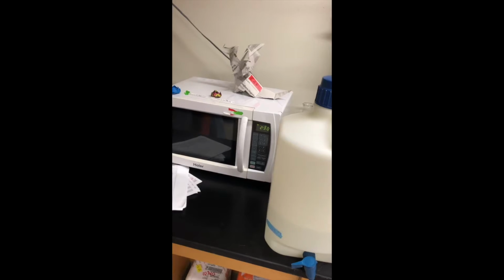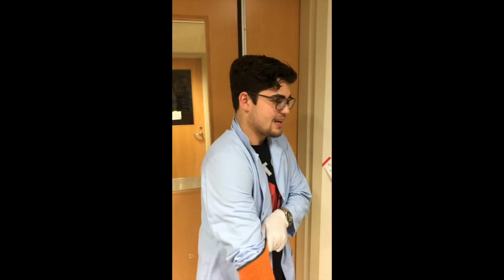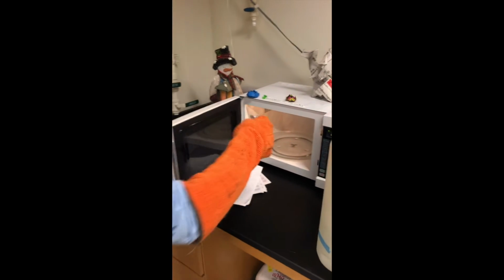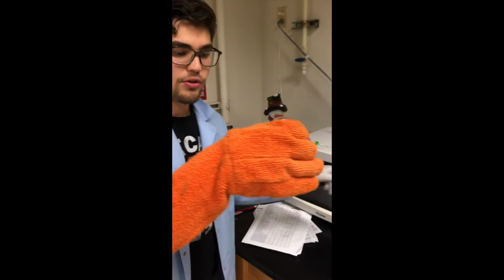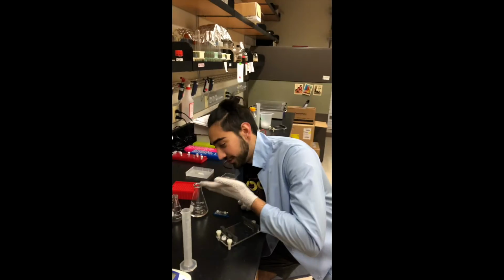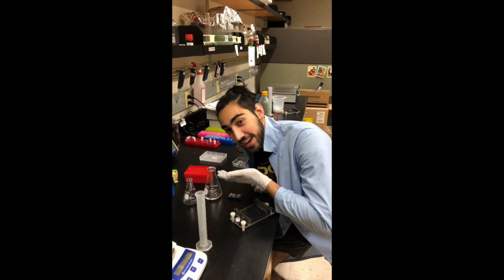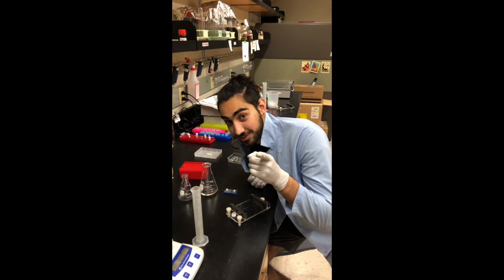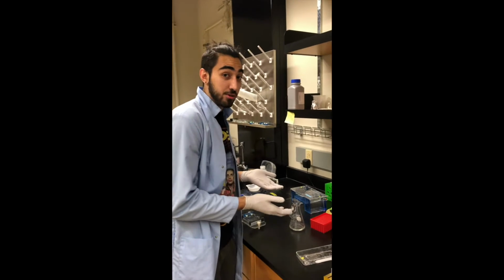Moments later. Okay, after you stop it, you're going to take it out and make sure that you have your heat glove on because this will be hot. I'm going to take it out, mix it around, make sure that all the agarose is dissolved in the TAE. This flask is very hot, so now we have to wait 2 minutes for it to cool to move on to the next step of the process. 2 very boring minutes later. 2 minutes has passed and we're ready to move on.